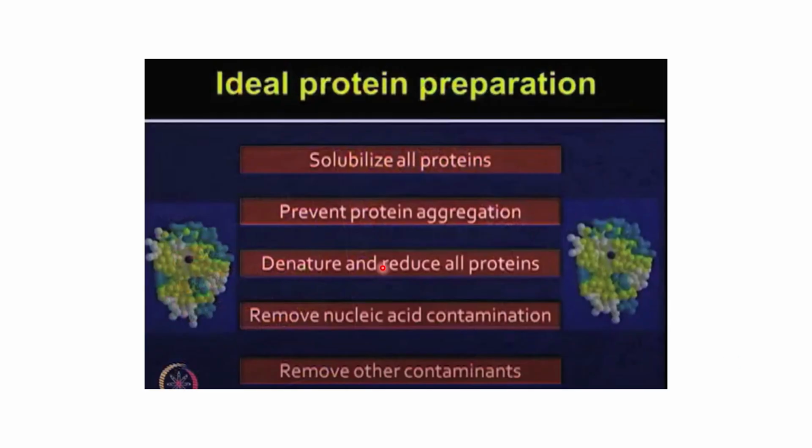So what are the preparation steps? You need to solubilize it first. You need to prevent protein aggregation. You need to denature and reduce all proteins, and remove nucleic acid contamination and other contaminants.